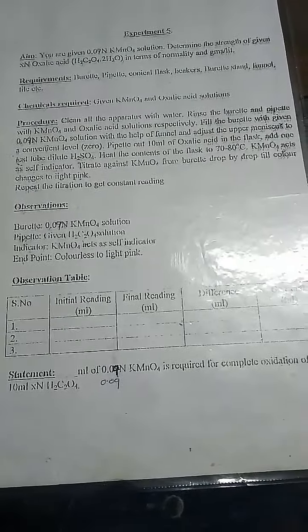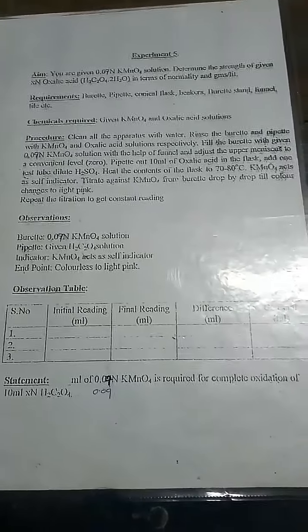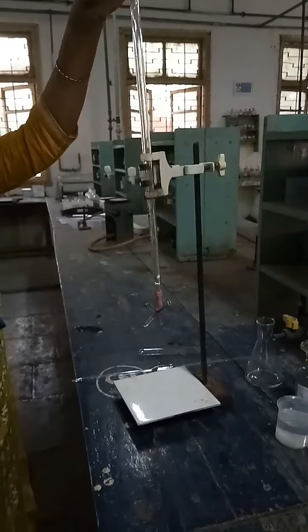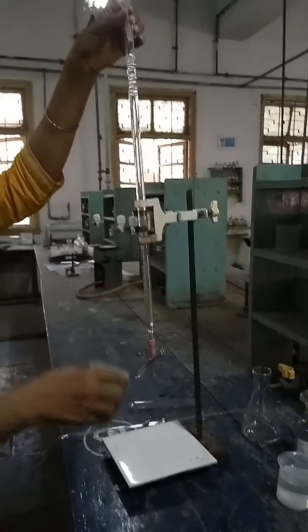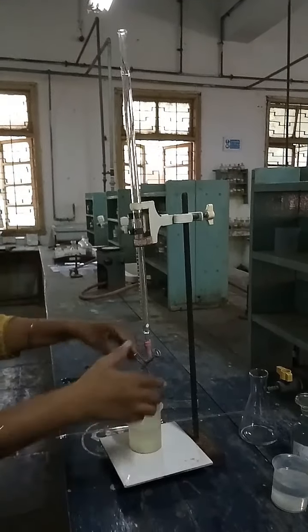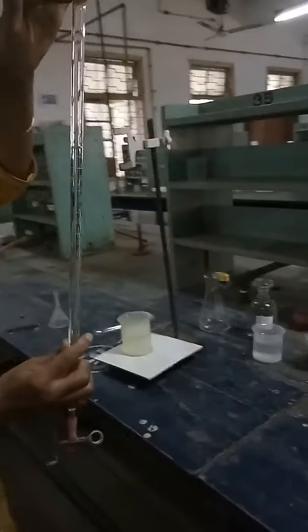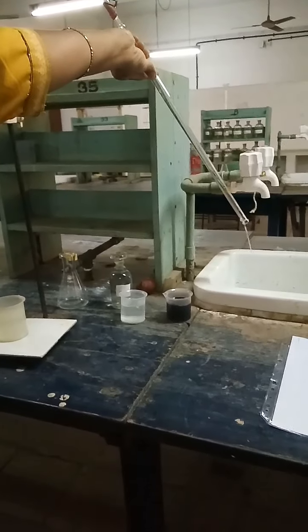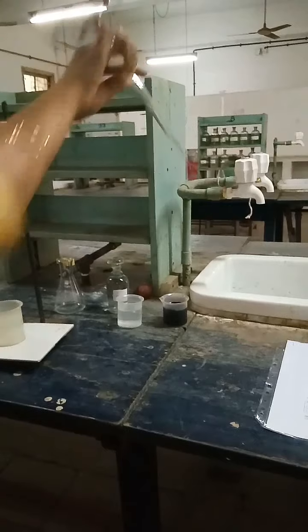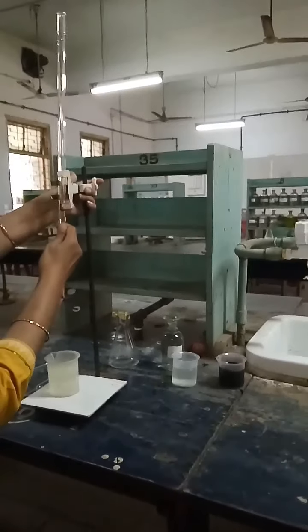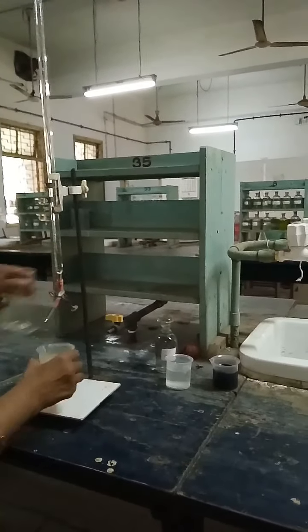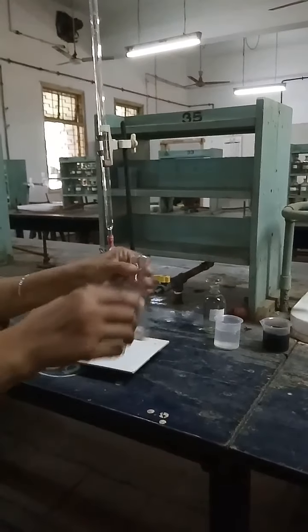Let's start the procedure. First of all, you have to clean all the apparatus with water. So here we are first cleaning the burette, and after that, the conical flask.